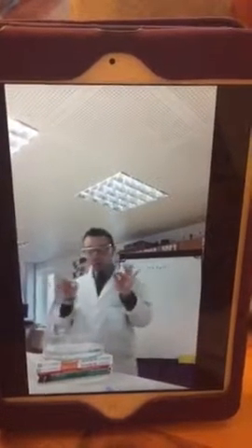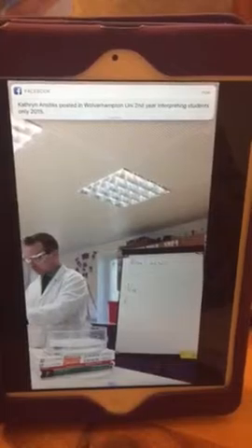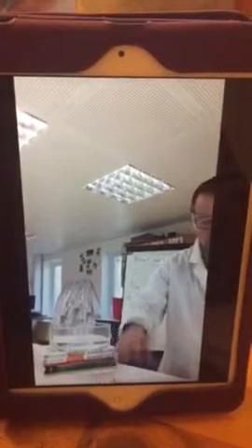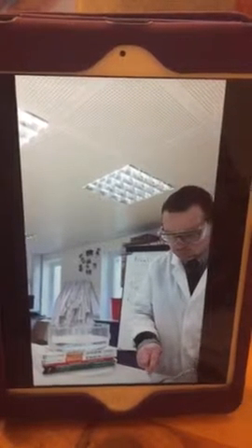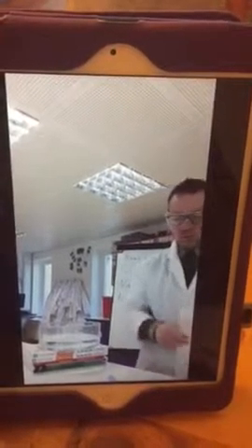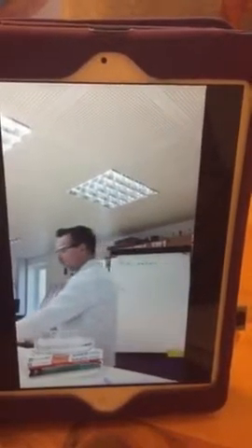Sometimes with the reaction you get a bit of a smell. But anyway, that's lithium done, so we'll move on to sodium now. I'll just get this one out so we can have a look at it, and cut a piece off like we did before. I'll just quickly show you this before we pop it back in. That's sodium. Again, it's really soft and comes apart quite easily, and again, it's very shiny as well.